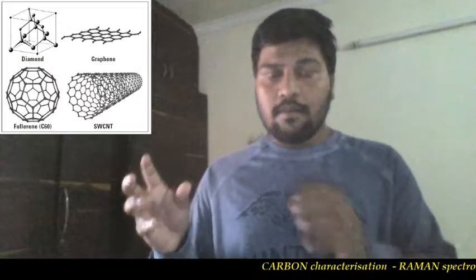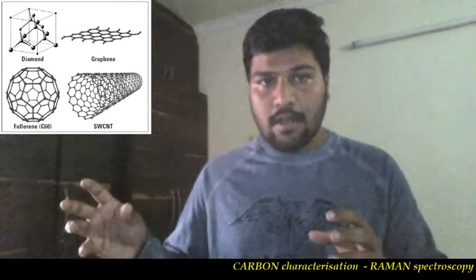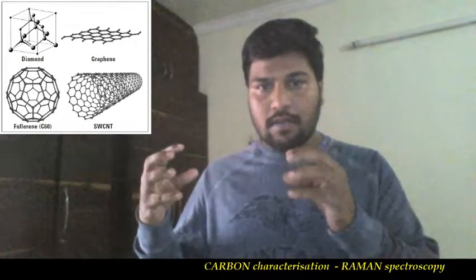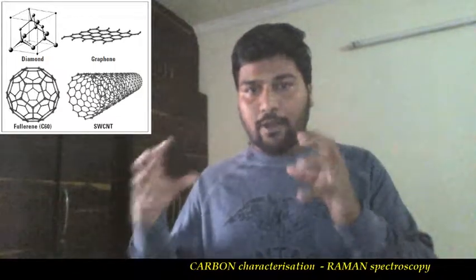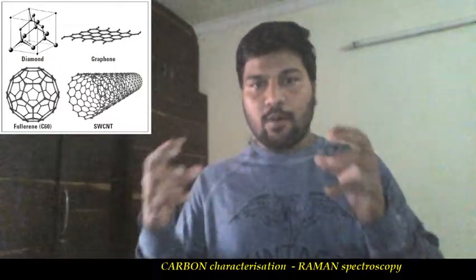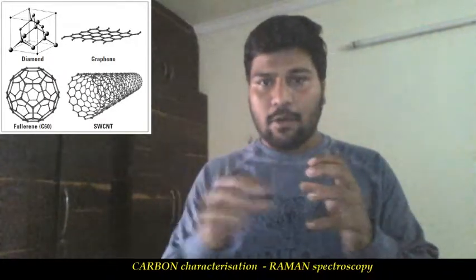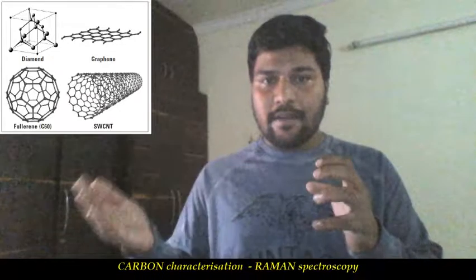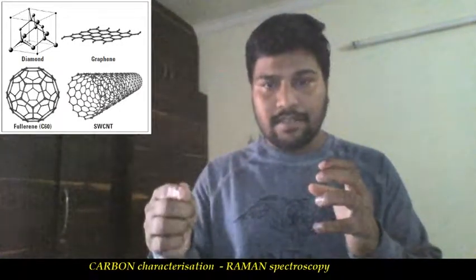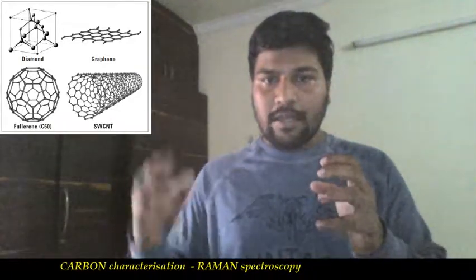the carbon is a carbon atom, like a ball, and the bond in which it is attached, you have two atoms, carbon and carbon, and between them you have a covalent bond. In real terms and practical scenarios, this bond is analogous to a spring system, and this carbon atom is compared to a ball.